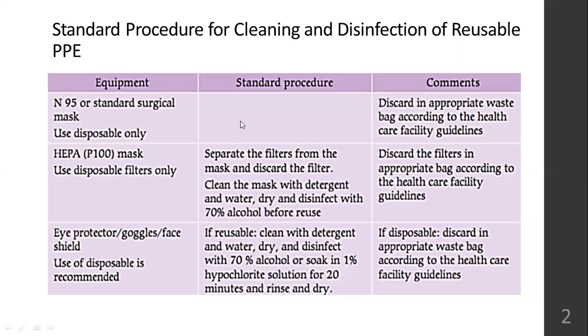You can separate the filters from the mask, discard the filter, but the mask you can clean it with detergent and water, dry it, or you can disinfect the entire mask with just spirit and reuse it. But filters have to be discarded and changed every day. Okay. And that is how you take care of P100 mask.